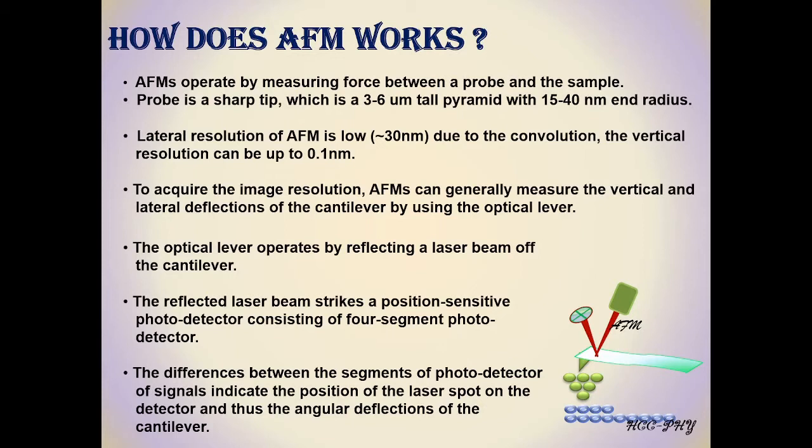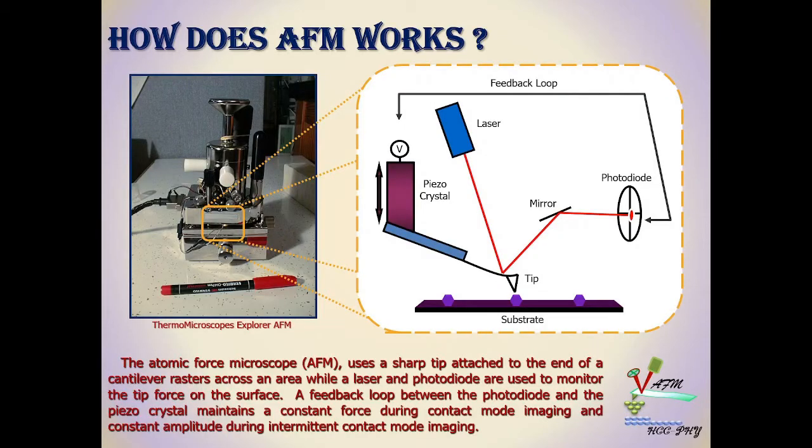So here, as the tip is repelled or attracted to the surface by intermolecular interactions, that is forces, between the atoms of the tip and the surface, the cantilever will be deflected. The magnitude of deflection is monitored by a detection system. A feedback mechanism from the detector system will adjust the piezoelectric scanner and maintain either a constant force or constant deflection mode between the tip and the sample surface. It depends on the AFM setup.